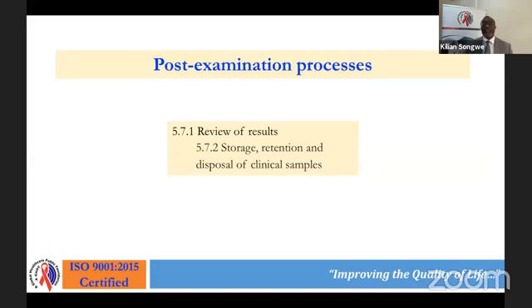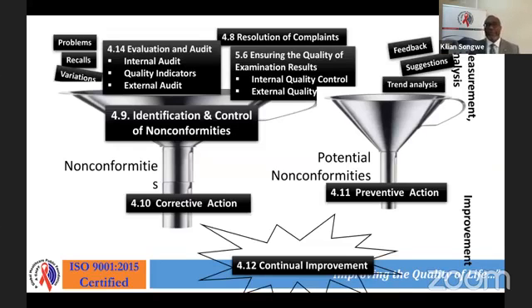In this case, we're dealing with COVID-19. COVID-19 at the very minimum needs a biosafety level 2 cabinet for us to be able to conduct the initial testing. So there are a lot of things that need to be looked into as we go into that.